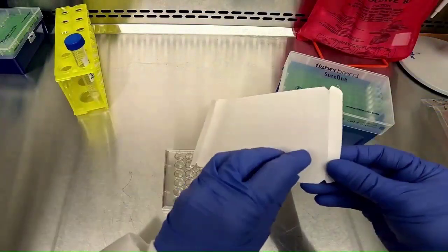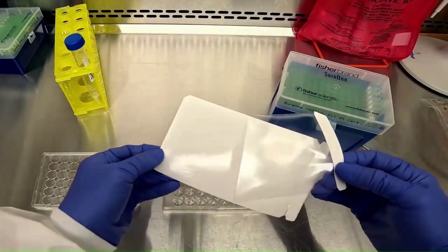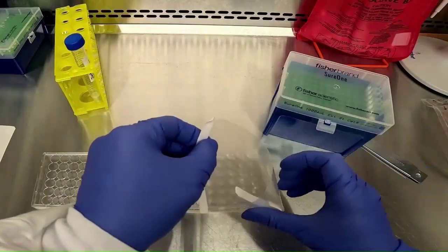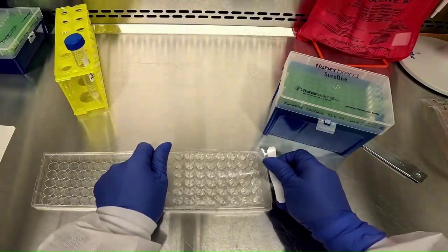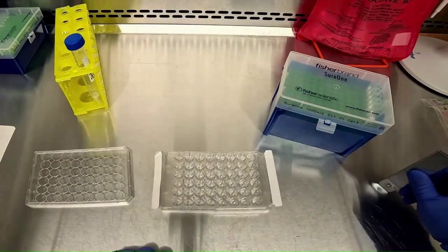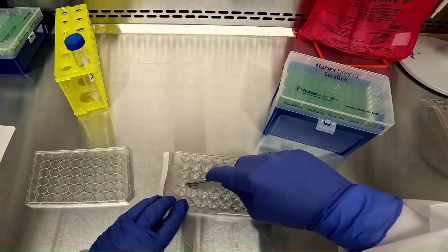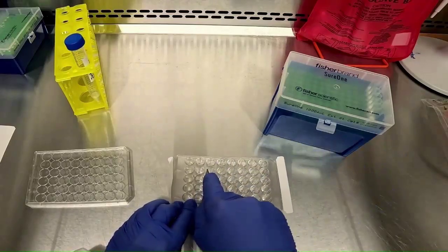Because we're only working with 8 flow cells, we're going to seal the rest of the plate with a plate sealer that comes included with the plate. This will prevent air from entering the microfluidic channels of the other flow cells that we're not going to use in this experiment. And this will also maintain sterile conditions in the plate. To do this, we're just going to use a razor blade to cut out the plate sealer that is on top of the flow cells that we're going to work with today.